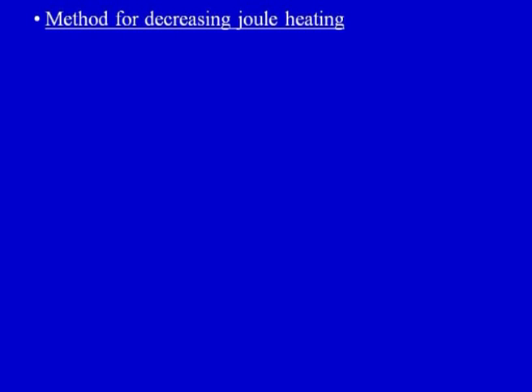Then there will be a decrease in viscosity of the buffer as the temperature rises or heat is generated, and as the viscosity decreases, there will be a reduction in the resistance of the medium. So, these several effects will certainly occur when heating occurs, and they will affect the electrophoresis run. Now, there are methods for decreasing this heating.